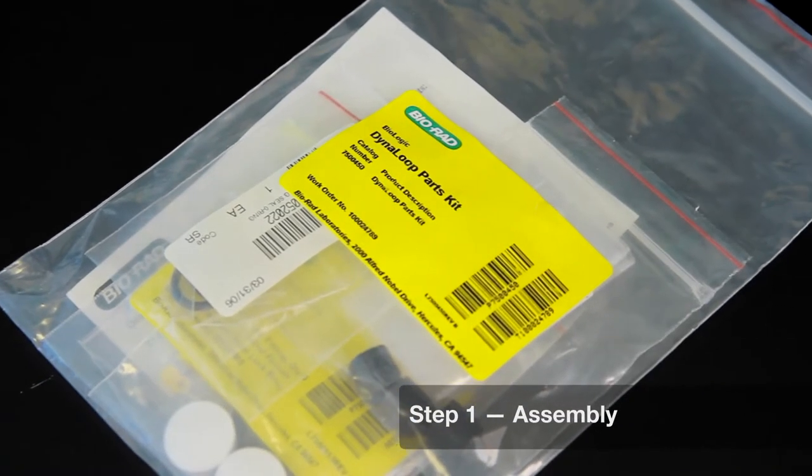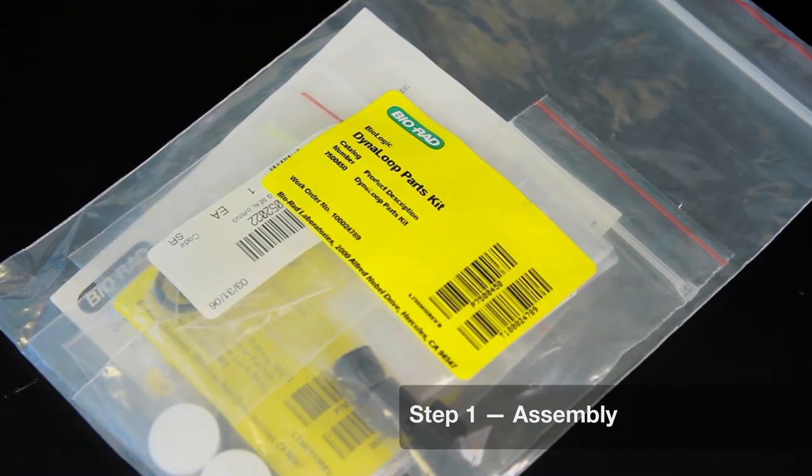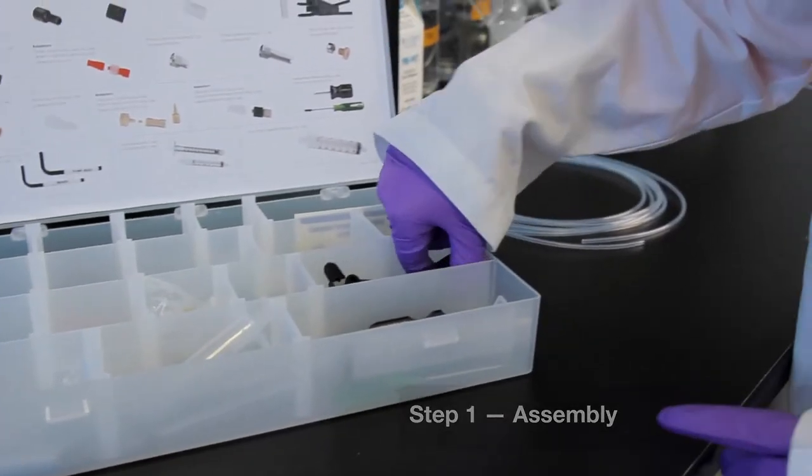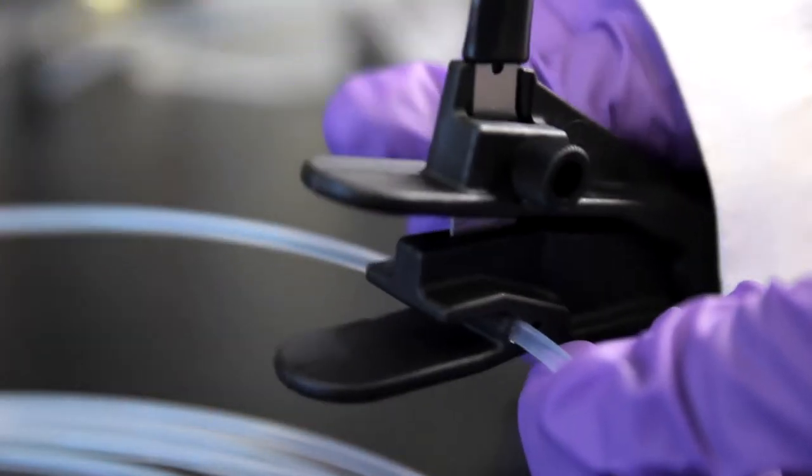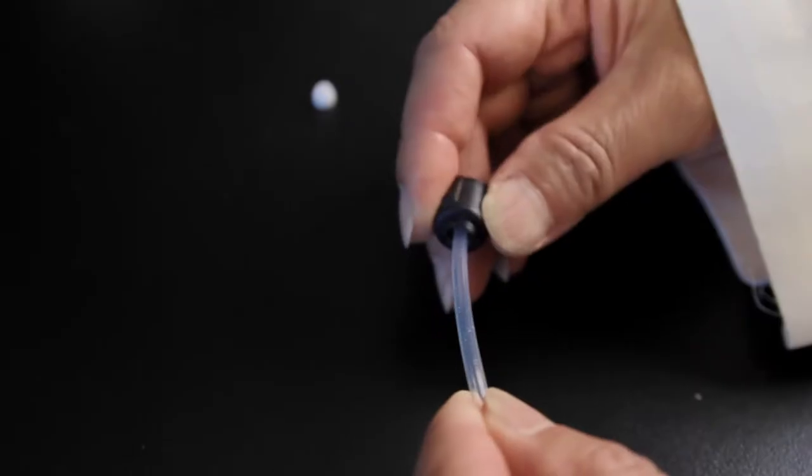We'll begin by assembling the Dyna Loop using the provided Dyna Loop Parts Kit. First, you'll blunt cut a piece of 1/8 inch tubing to the desired length using the tubing cutter from the NGC Fittings Kit.